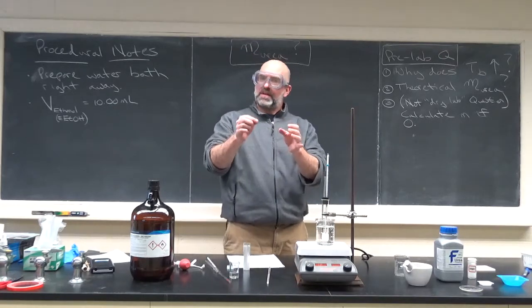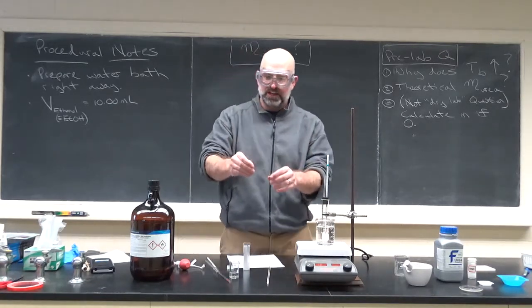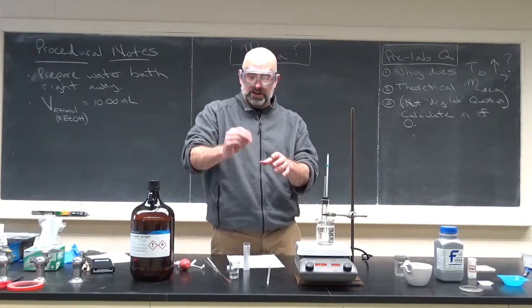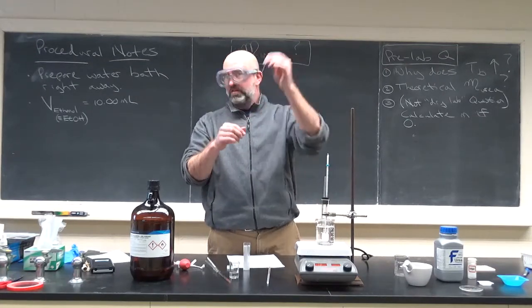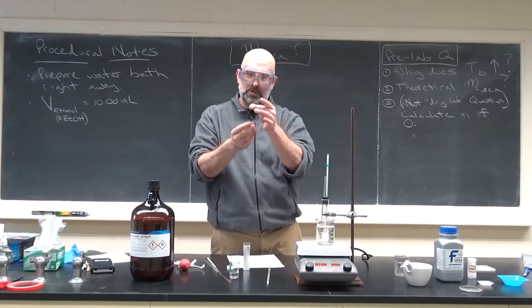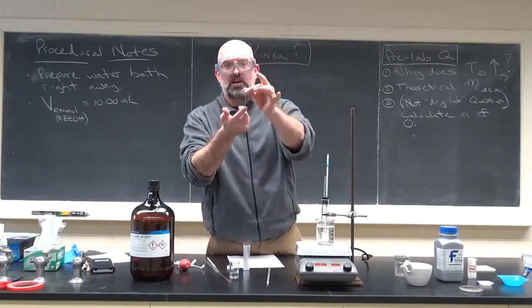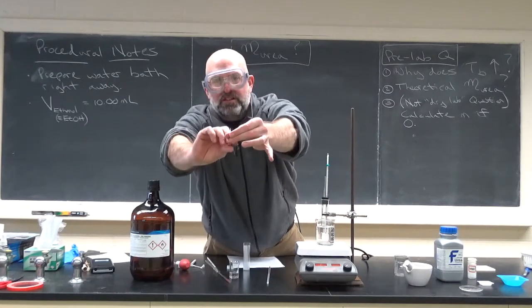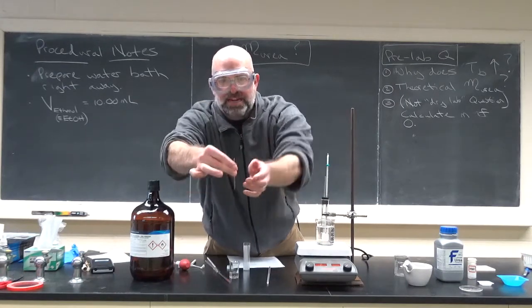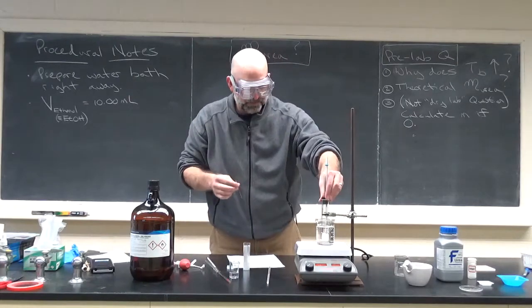We used these last semester to measure melting points. We had a solid, remember, you tap it and get some solid in there, and you measure the melting point using the device. So it's the same tube, but we're using it for a different purpose. It's got the closed end and the open end, so you want it to go open end down. You want to kind of plop it in there.